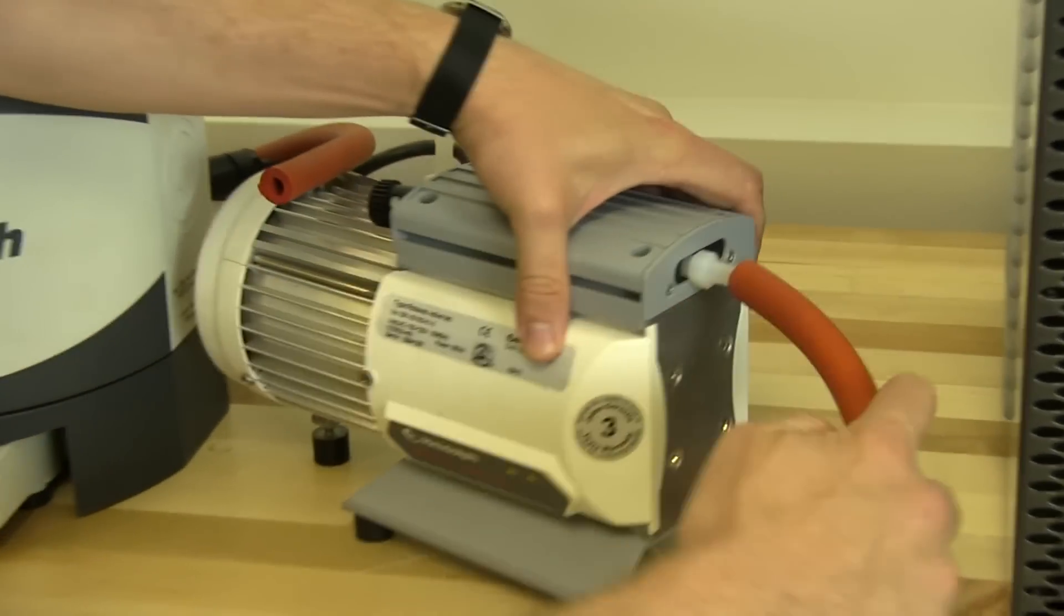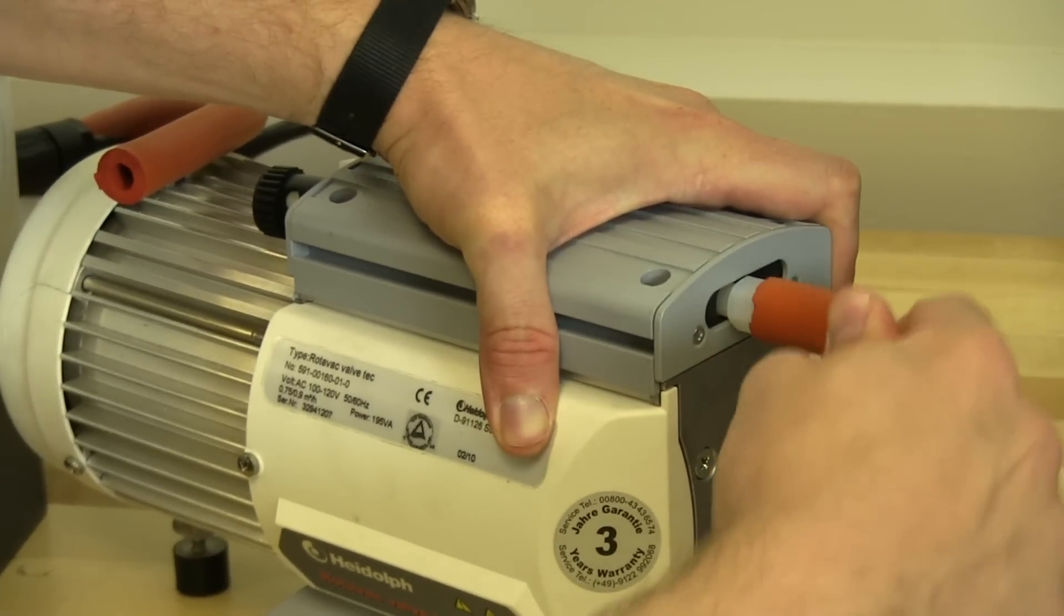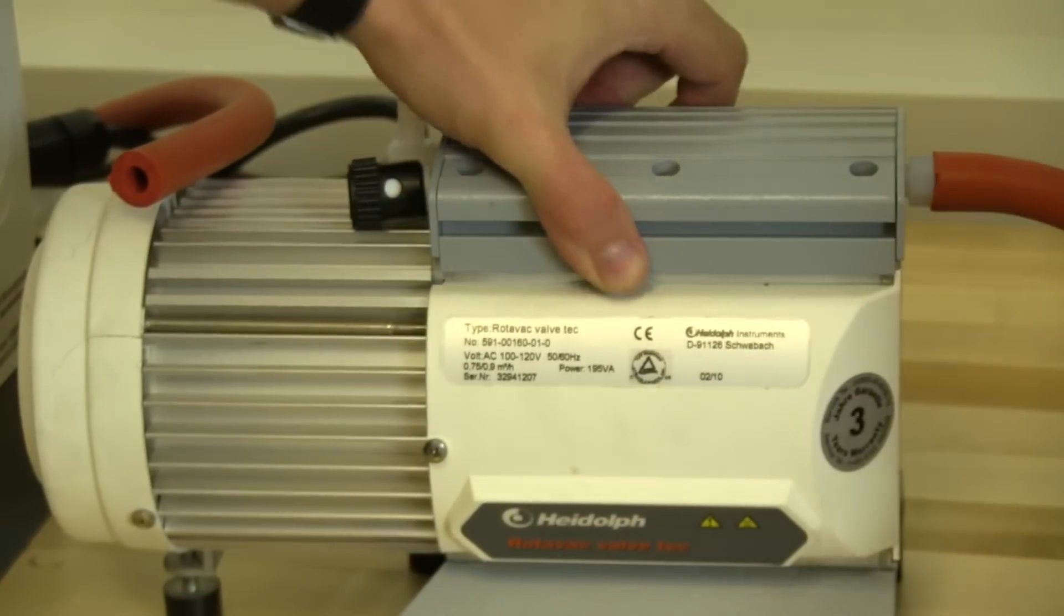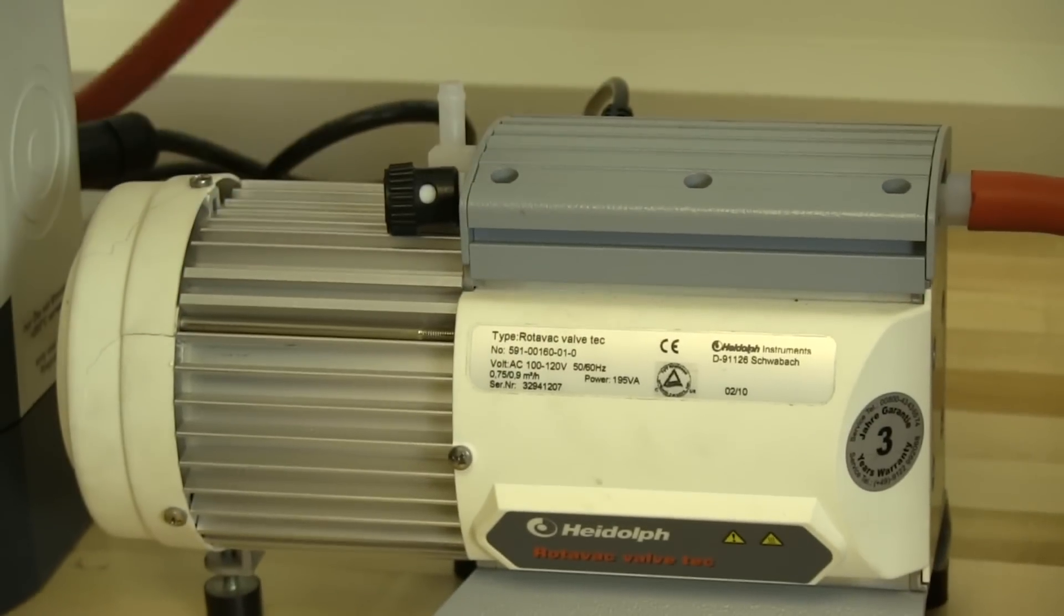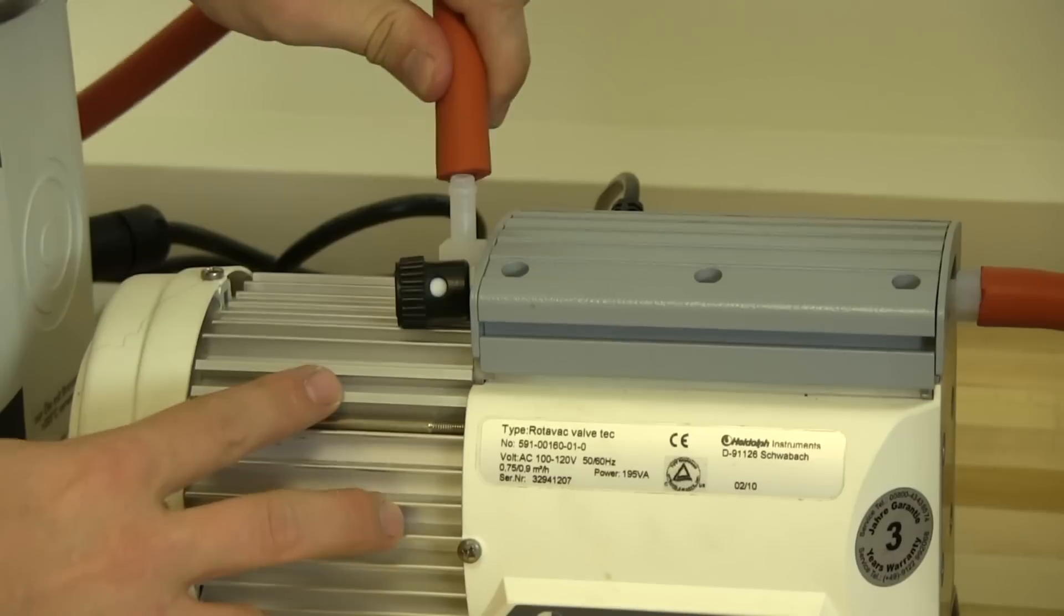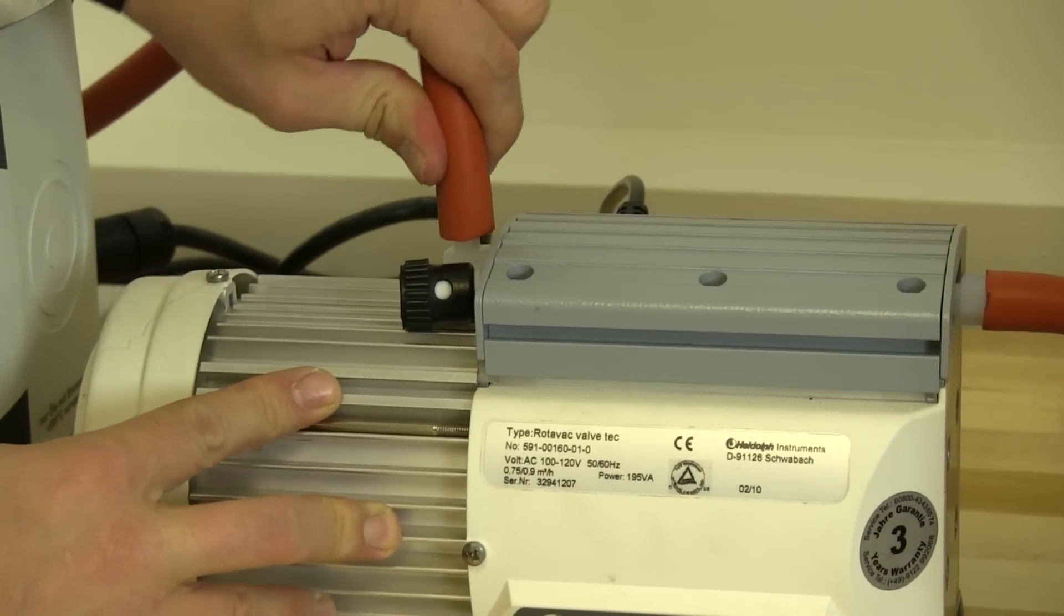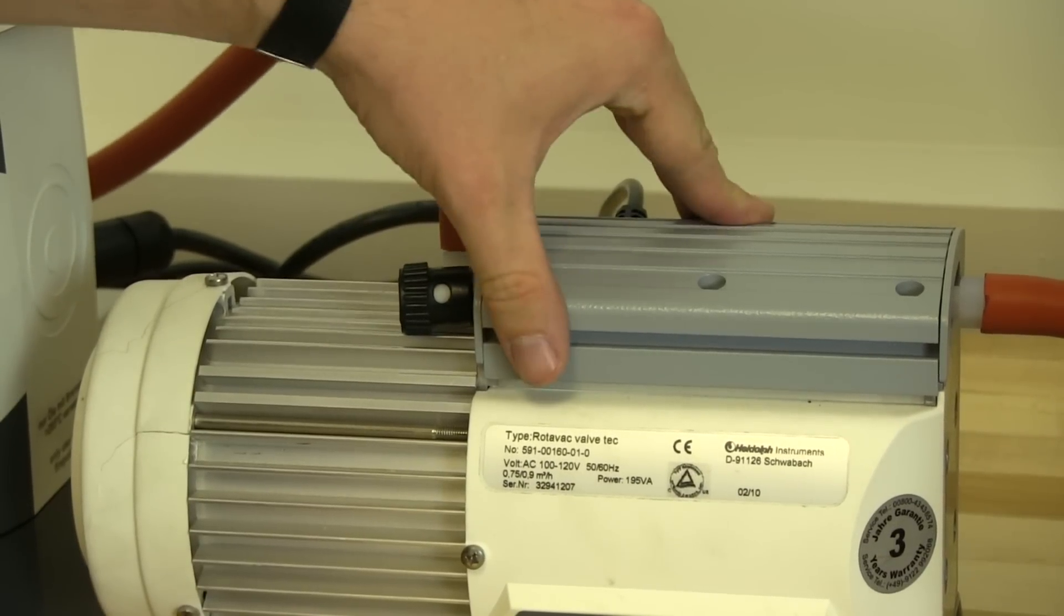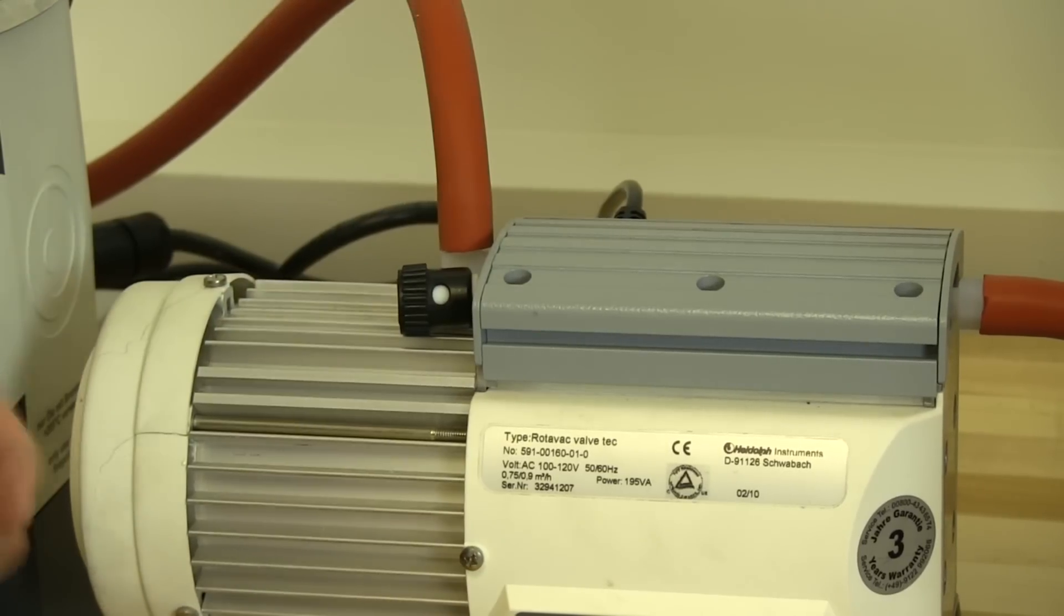So it just fits on, doesn't have to be clamped or anything. And then vacuum tubing onto the inlet, and that's going to connect to the glassware.